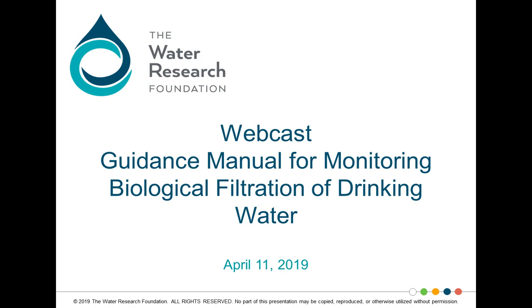The Guidance Manual for Monitoring Biological Filtration of Drinking Water, Project 4620, was funded under the Biofiltration Research Area and focused on practical biofiltration monitoring tools that provide rapid feedback on the performance of biological filters. During the webcast, the research team will present data from the study and provide information on various monitoring tools.